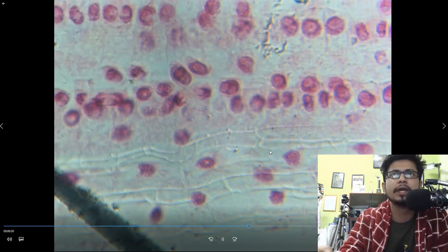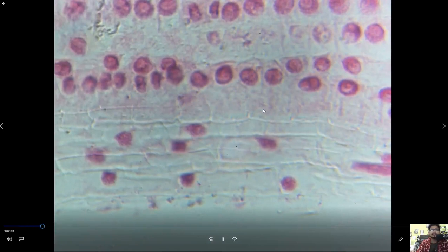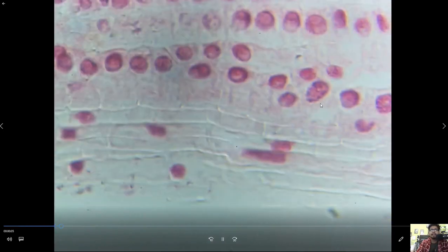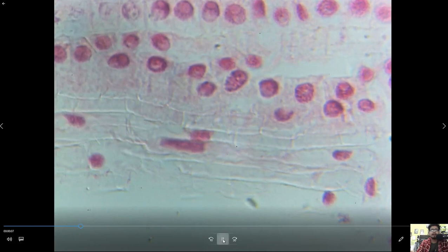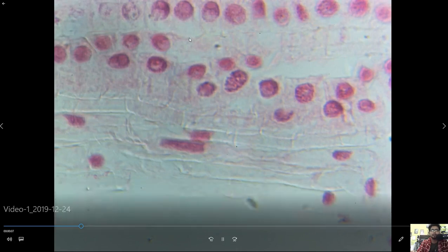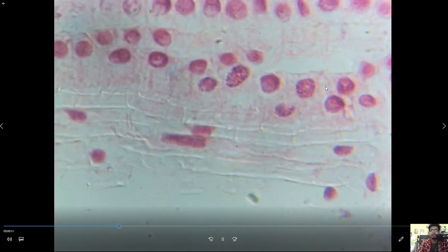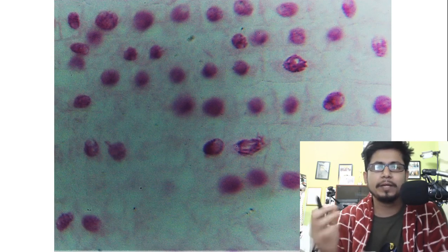In this picture at the end of anaphase — the late anaphase — all the chromosomes are separated to the opposite poles. Now the septum or cytoplasmic barrier will be created between them, and once it's created you can see structures like this: two nuclei separated from each other.